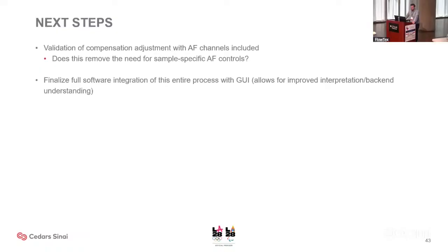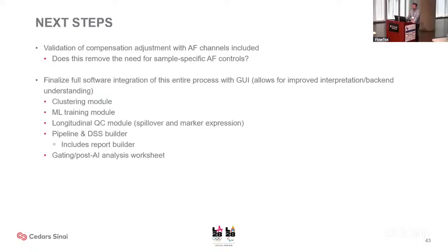And then finalize the full software integration of this entire process into a graphical user interface so that it allows for more interpretability and back-end understanding of what's actually happening. So the first implementation of this was all hard-coded into R. The current one's all hard-coded into Python. So we wanted to make this into an actual platform that is understandable for people and that a person without a computer science understanding can actually work with.